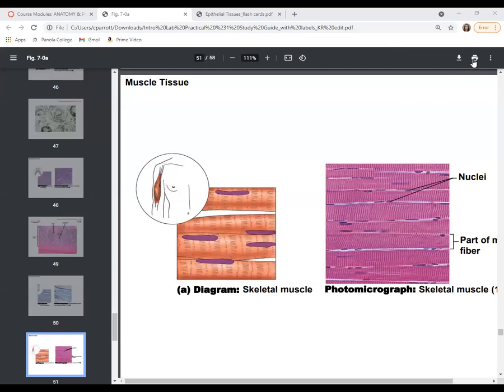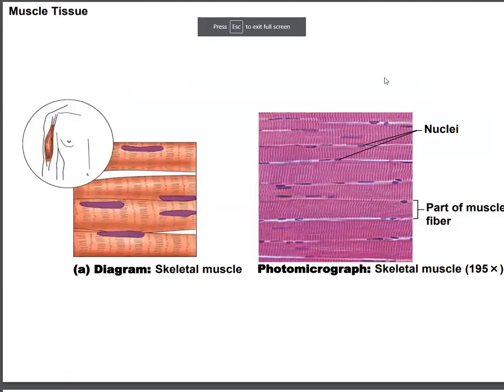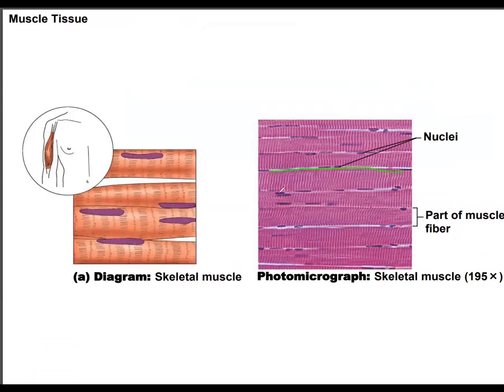Okay, so now we're going to cover both muscle tissue and nerve tissue. So when you see these big, thick fibers here, and these fibers are tiger striped or they have striations, this is going to clue you in that this tissue is skeletal muscle. So again, here's one long muscle fiber. You can see it's very thick, and you can see the tiger striping or the striations inside that muscle fiber. If you see those big, thick fibers that have those tiger striping or striations, that clues you in that this is skeletal muscle.